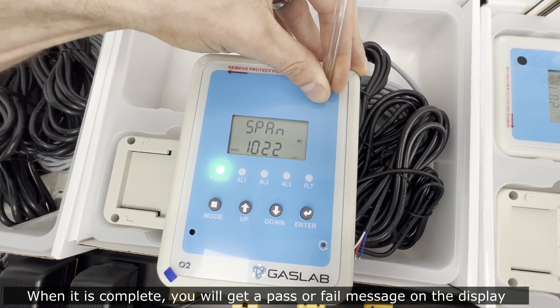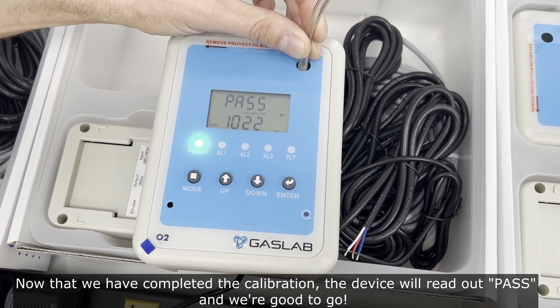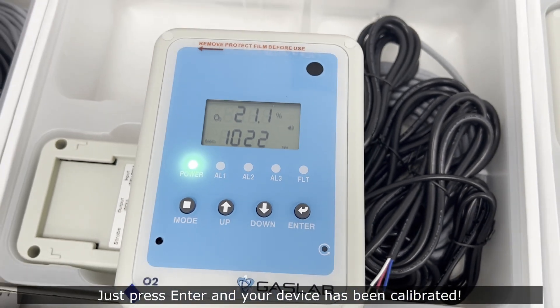Now that calibration is complete, the device will read out 'pass' and we're good to go. Just press enter and your device has been calibrated.